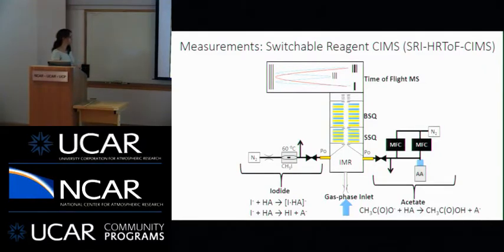So we can currently produce I- ions, so iodide, or we can produce acetate ions. And either one of those, depending on what we feed the system, can react with some given analyte, some molecule in the atmosphere. We're just going to call this HA and pretend it's an acid. And we can do a few different types of chemistry. So we can potentially form adducts. So with iodine and any molecule, it turns out peroxides and carboxylic acids form adducts with iodine. So you now have a negatively charged ion. So what we've done is we've taken our analyte and we have charged it.